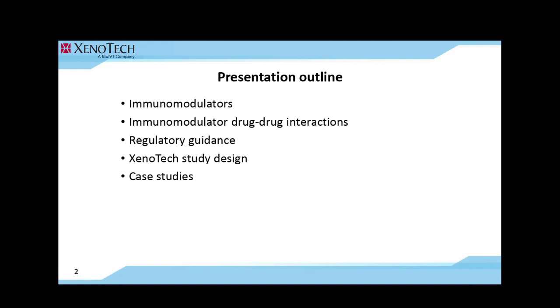The building blocks of our presentation are the definition of immunomodulators, background on immunomodulator drug-drug interactions, regulatory guidance in this area, XenoTech study design to address the issue, and 3 case studies done according to our experimental design.